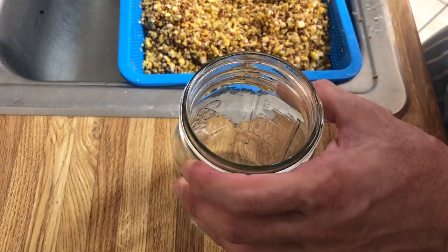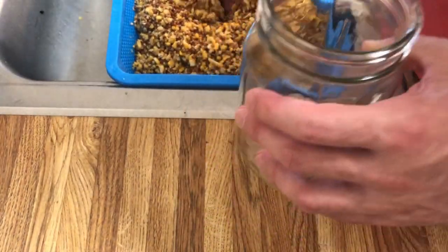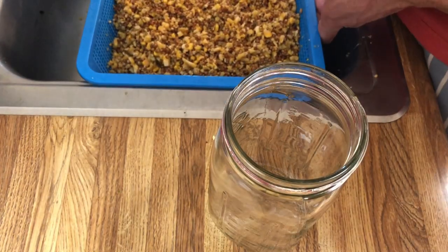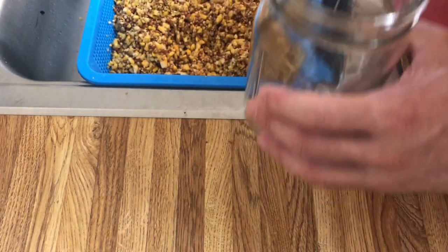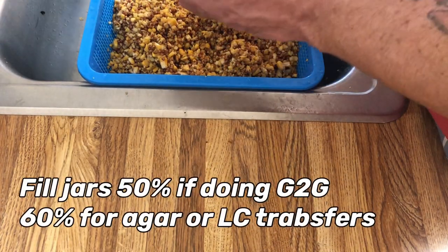Now we're gonna fill up our grain jars. So it's been 30 minutes. Basically, I just make sure there's no more water coming out the bottom of the strainer. That's how I know it's ready. A lot of times it'll be ready in, you know, 20 minutes. I do 30 just because.